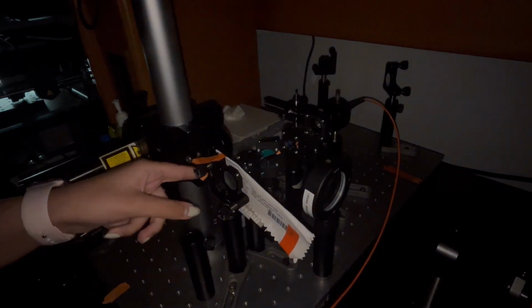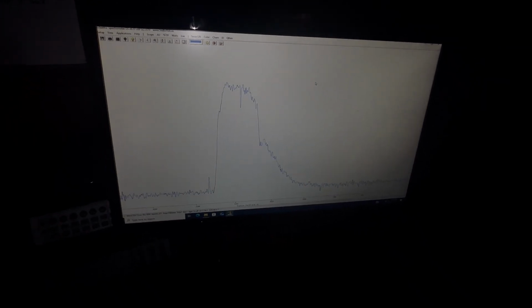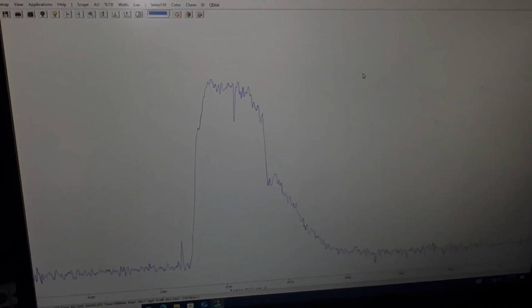Using this test setup, we collected data from an ISO-adjacent cotton sample 3 times and recorded the spectrum each time. The integration time used for each trial was 10 seconds, keeping in mind that our engineering specification stated we should have an overall system response time of 15 seconds. For each trial, we placed the sample, let the 10-second integration time run, collected the spectrum, then removed the sample. We allowed the spectrometer to zero out before placing the sample back and beginning the next trial.